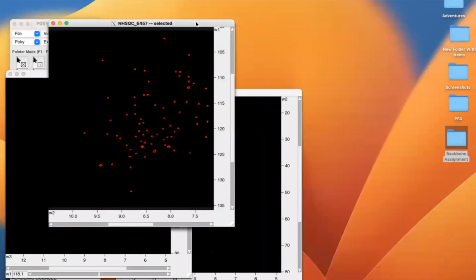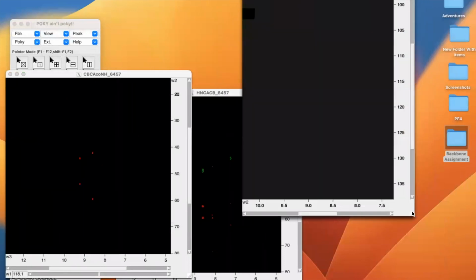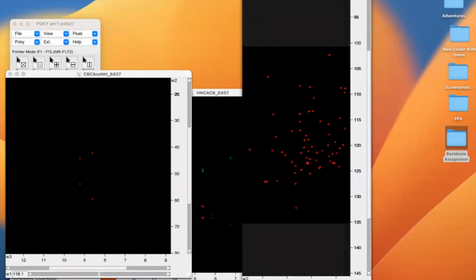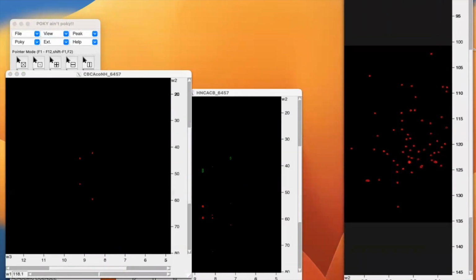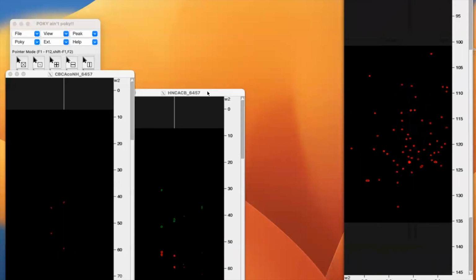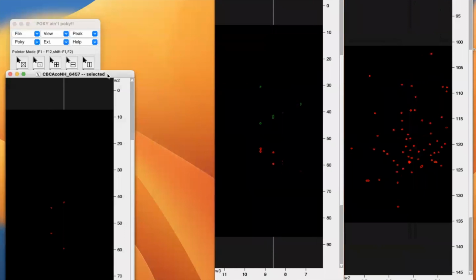Now I'm going to spend some time organizing our workspace. I'm going to pick one of our windows and set it to the dimensions that I would like. Ensuring that it is selected, which you can see here, I'm going to type in the two-letter code US. This changes each of the windows to have the same dimensions, making a more uniform workspace.